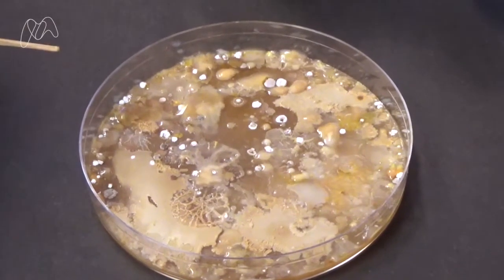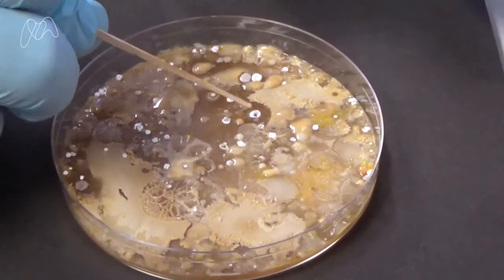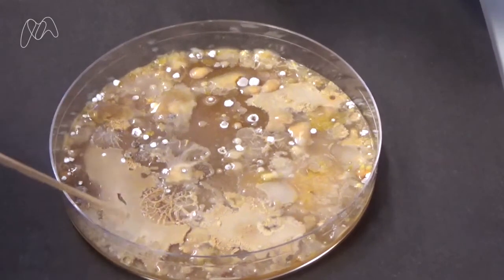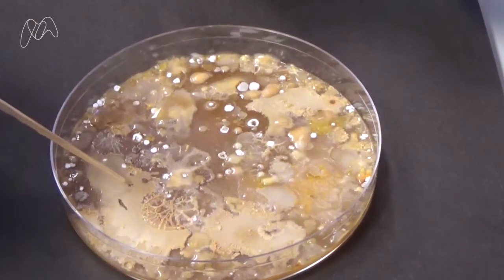The plate is a little bit like a landscape. Some of them grow in little colonies like this, and they're quite hard. Others spread out across the plate, and they're quite soft and gooey.